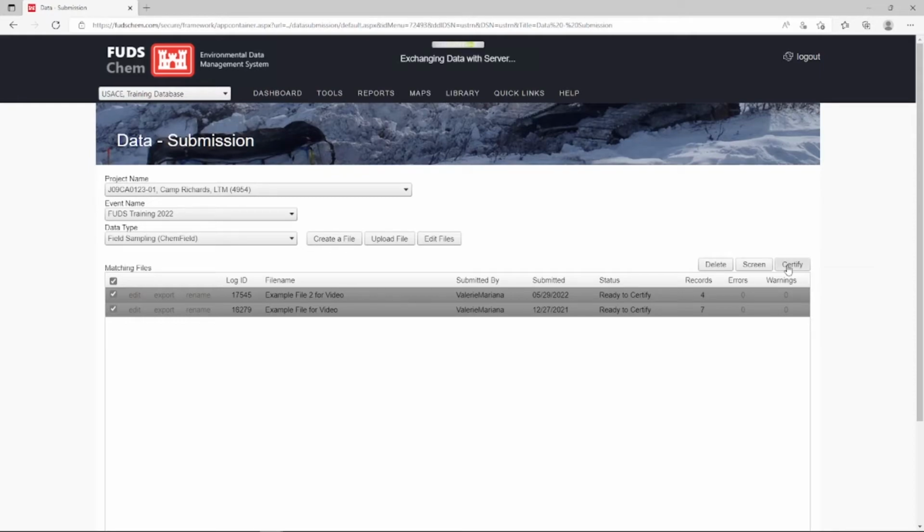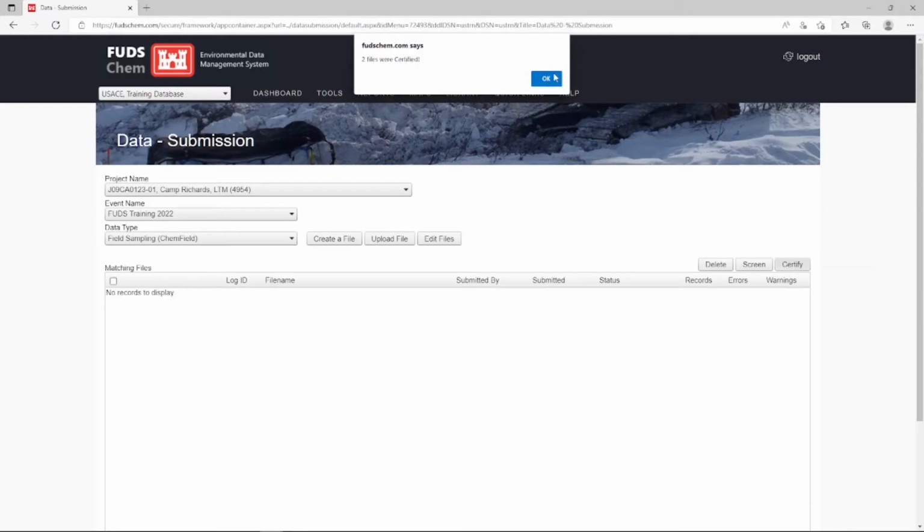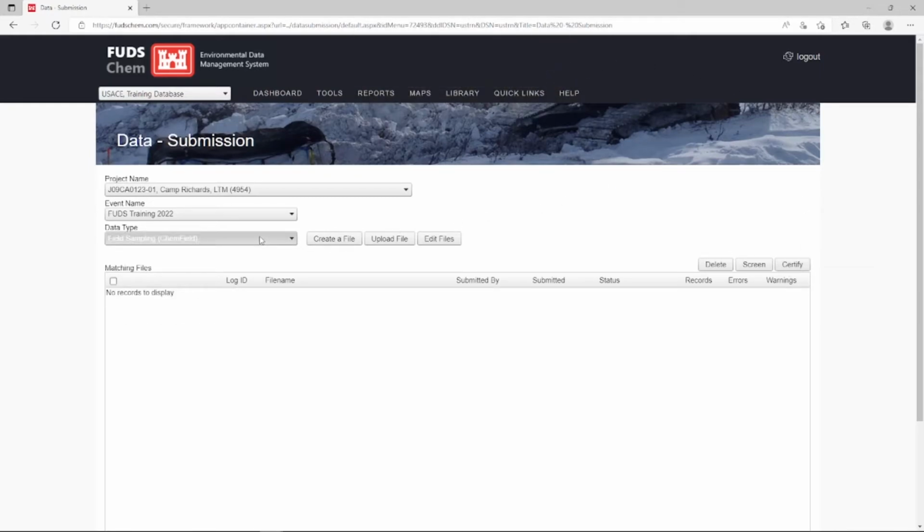When the lab loads their data in SED 5.2 format, they will need to be careful to include all of the samples that are associated with a blank in the same file as the blank sample. The Automated Data Review, ADR, is run on a file-by-file basis and cannot apply blank contamination qualifiers based on a blank sample reported in a separate SED file from the associated samples.